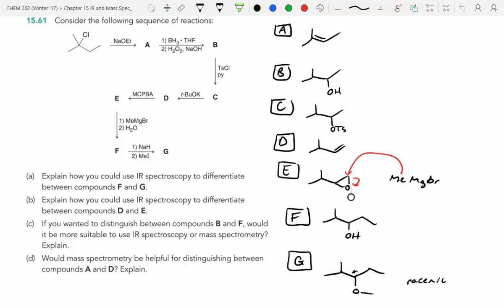I'm saying no. So we're looking at A and D here. I'm going to circle them. If you took off a carbon of A, you would have a positive charge up against a pi bond. Exactly. So Grace was saying on molecule A, if you remove a methyl group, you'd have a positive charge on a pi bond, right?